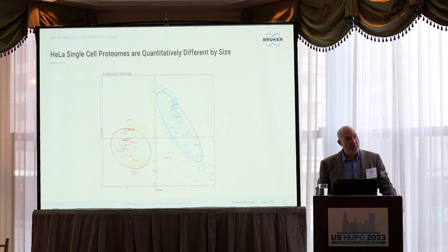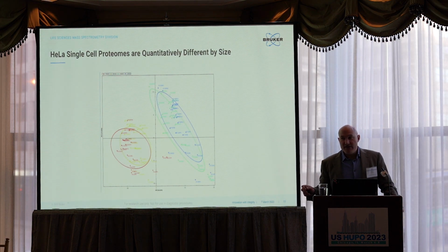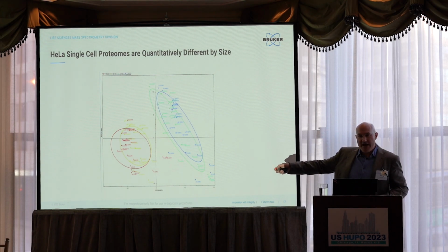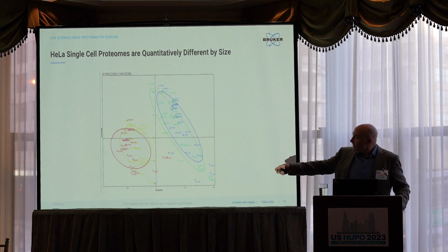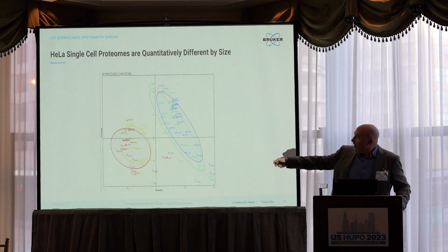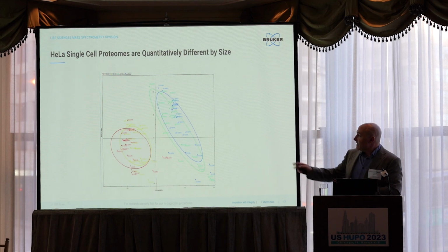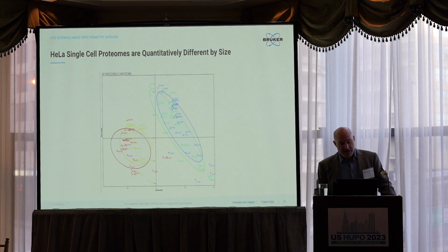So of course, we can also do a PCA analysis. And what we find here is that those two very small subset cell types, so this is the 18 to 21, and then this is the 21 to 24 here, they have their own coordinate, and then whatever happens at that middle phase during cell growth and cell size really distributes them into their own quadrant. So that's really exciting to see.